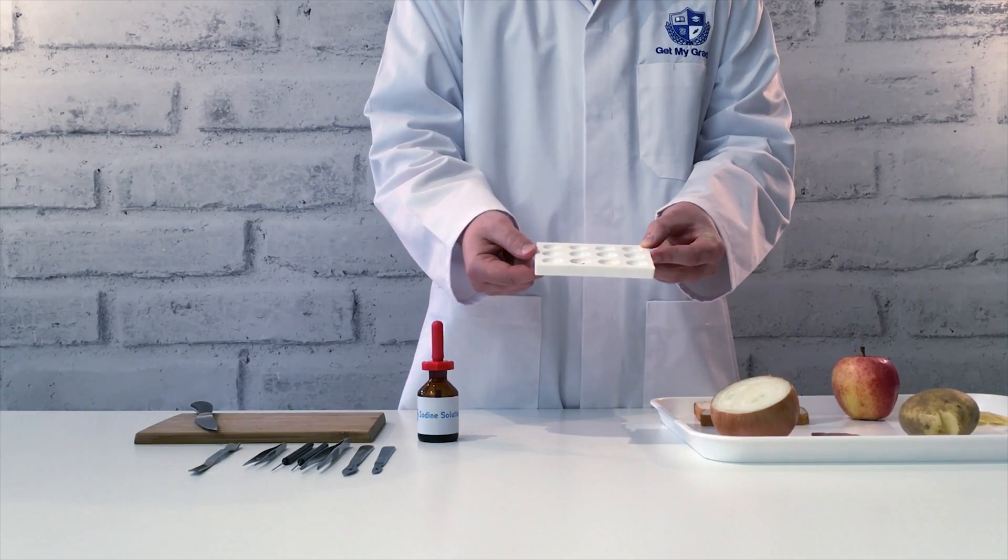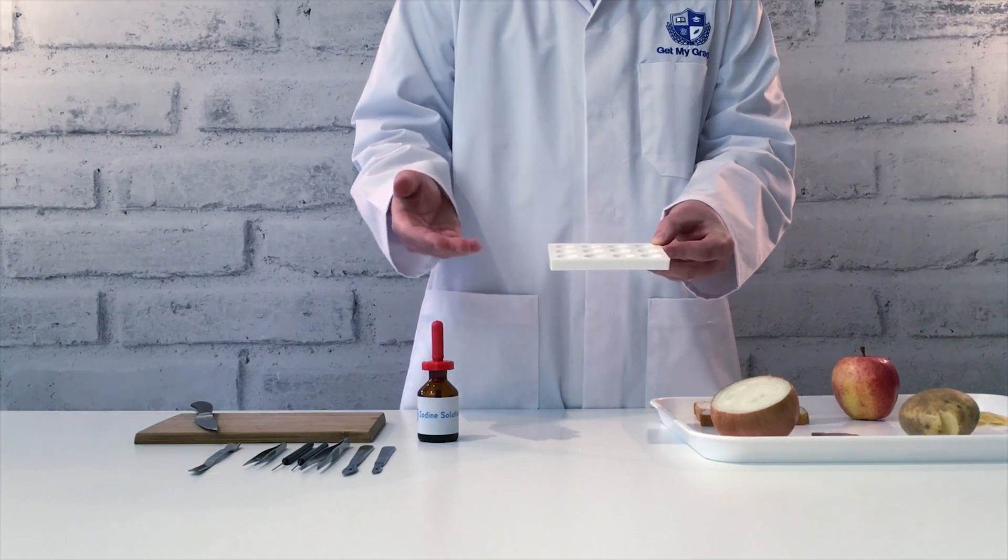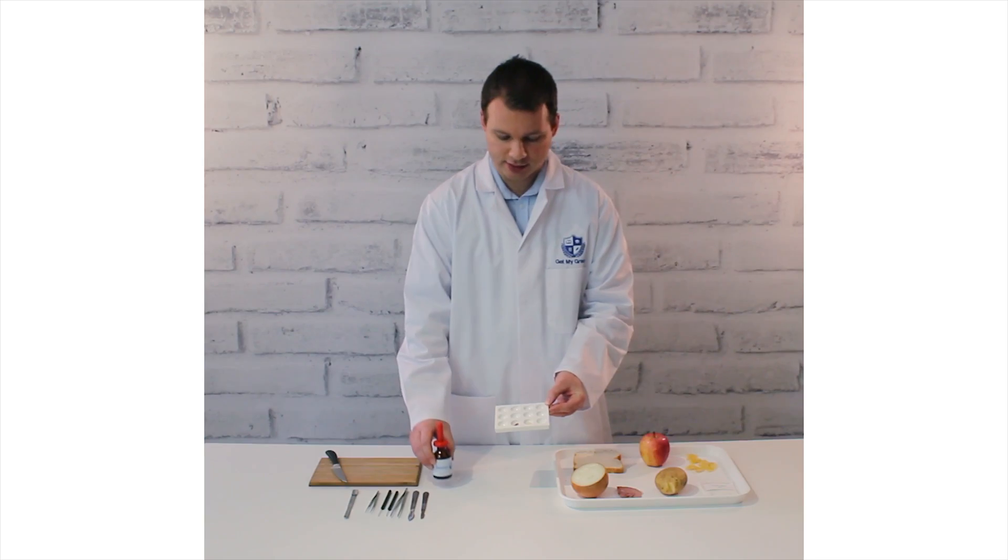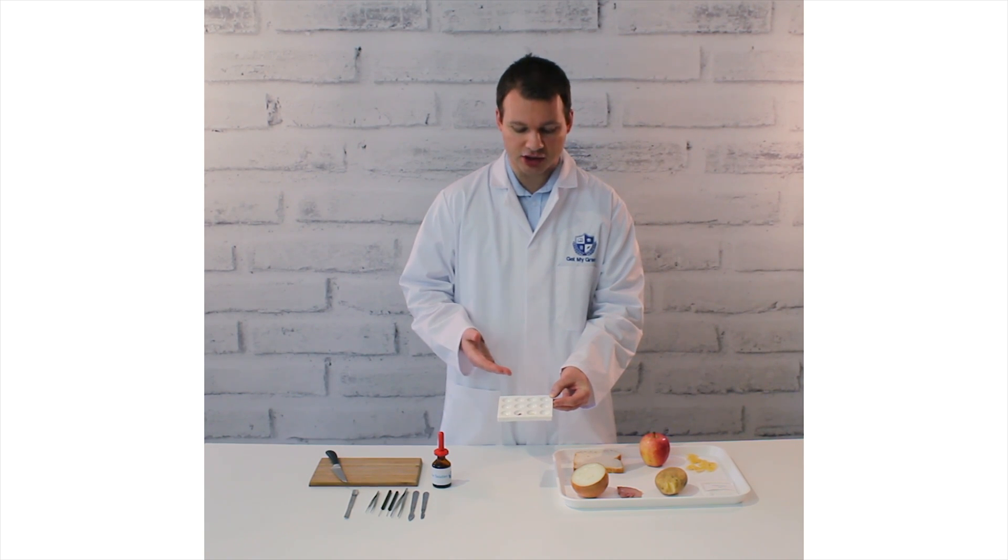So this is a spotting tile. The nice white color means that we can easily see any change in the color of the iodine solution that we're going to use, and that means we can easily identify if starch is present or not.